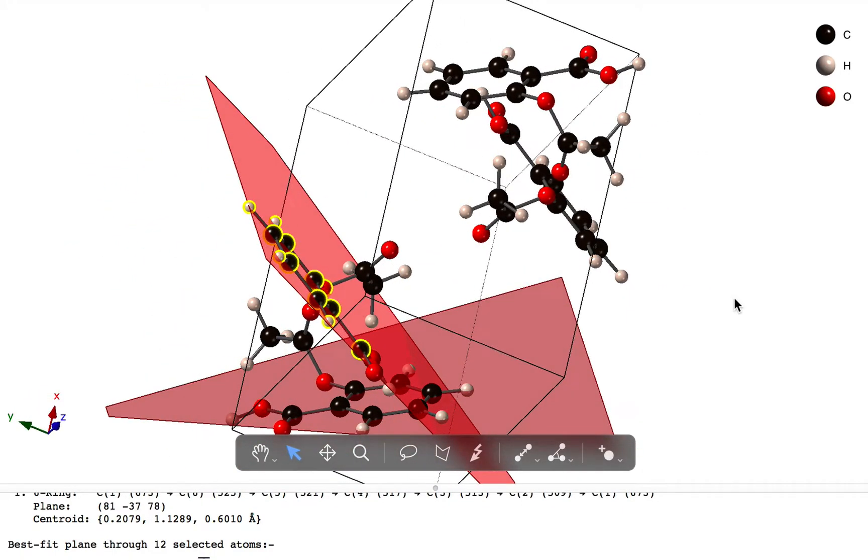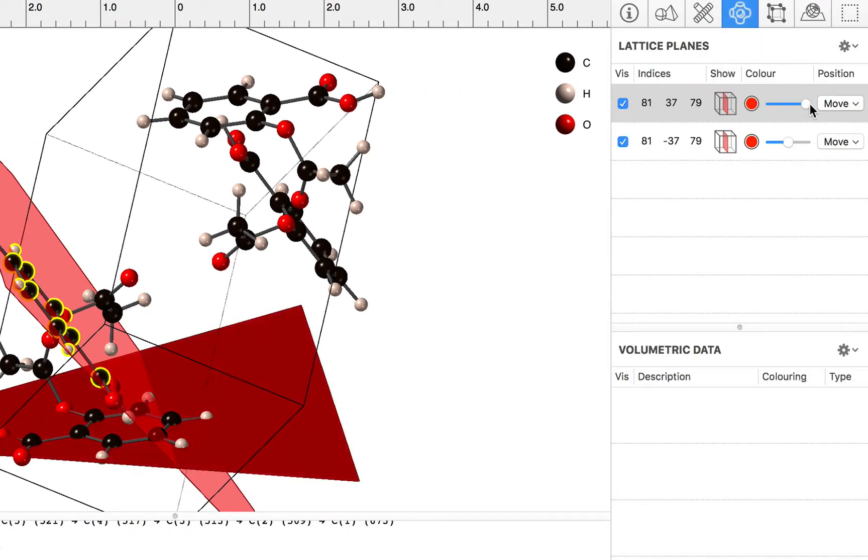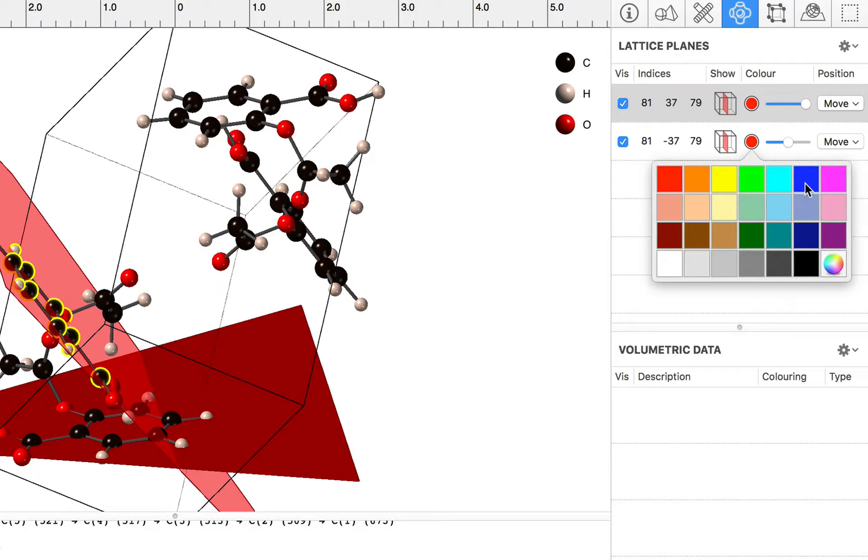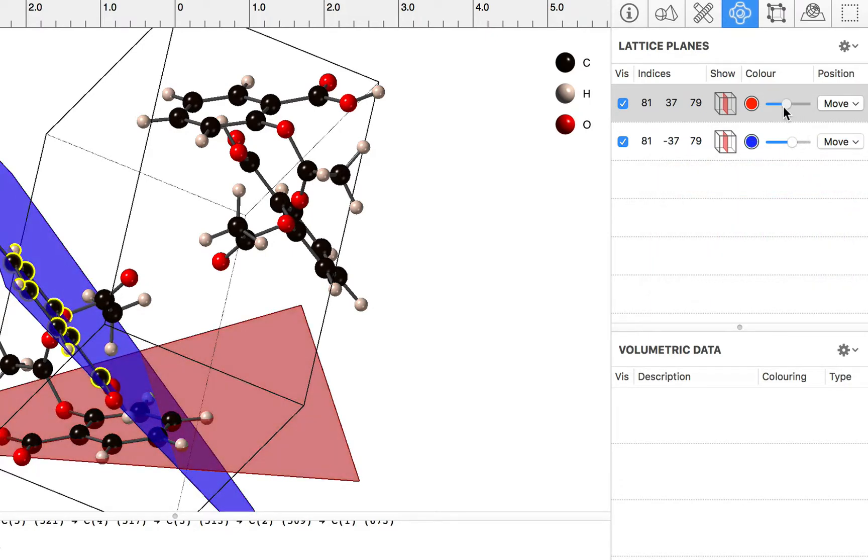Now the planes themselves are listed in the volume inspector, and we can change the colors of these planes. So let's have a blue plane and a red plane, and also their opacities.